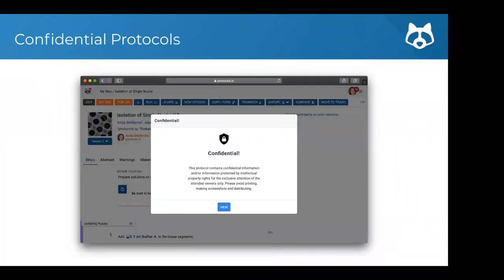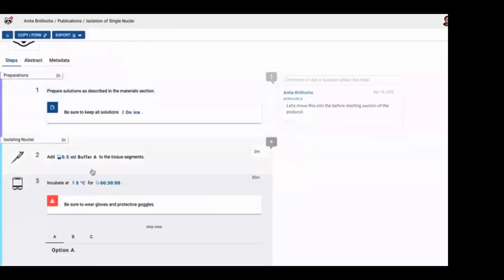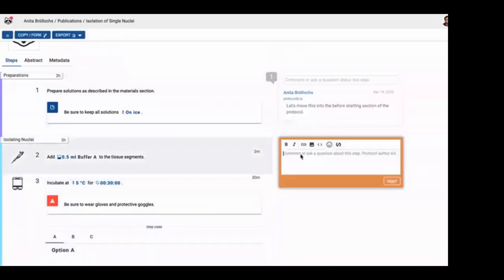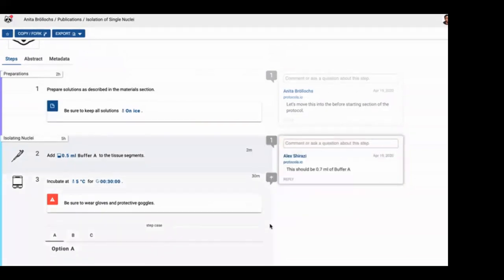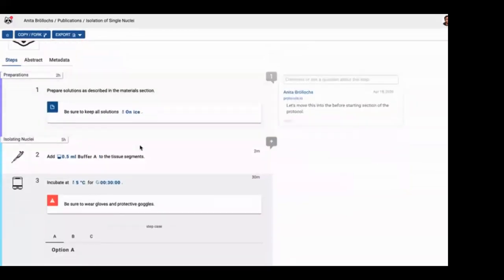If you're developing protocols and want to let people know they're still being developed and are confidential, you have an option to activate a confidential warning. If you share it with anybody, they'll see a pop-up letting them know this is confidential and shouldn't be shared. Once you've created your protocol and shared it with others, they'll be able to add comments on it. The commenting functionality is a really great way to keep working on the method — the discussion happens right there on the protocol.